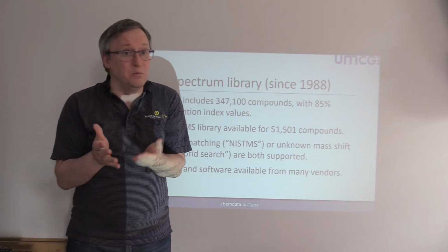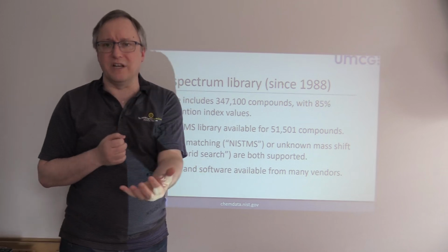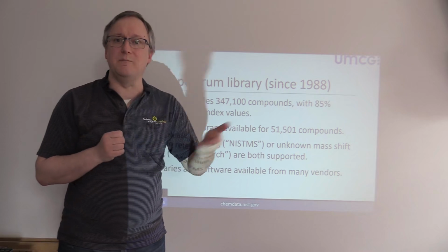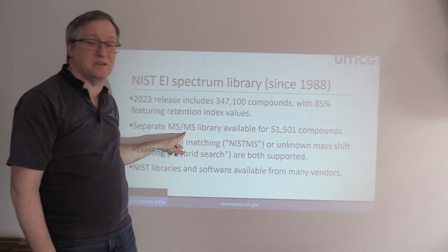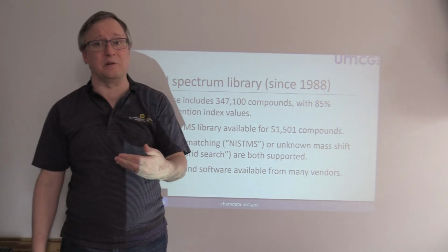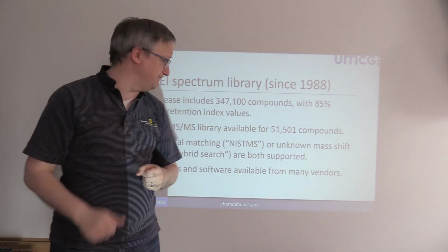In LC-MS, you wouldn't even attempt to identify that spectrum by comparing it to the corresponding unmethylated sequence because it's got the wrong precursor mass. And in the LC-MS library, you're going to use that precursor mass to help you figure out which spectra are even comparable to your metabolite.